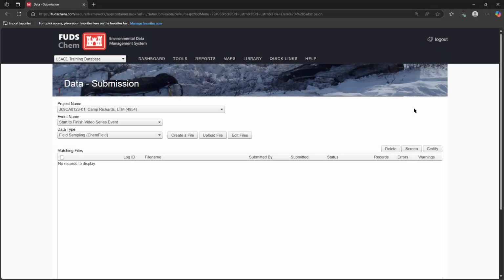Certifying the second one is complete. Now the lab can upload their data whenever it's ready. I have some other data from the field that I'll enter now too. That includes environmental measurements like turbidity and pH, and groundwater elevations that I took during our field deployment, plus some info related to the well installations, including lithology data, well intervals, and well construction info.